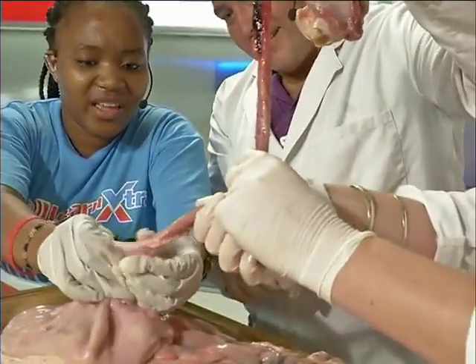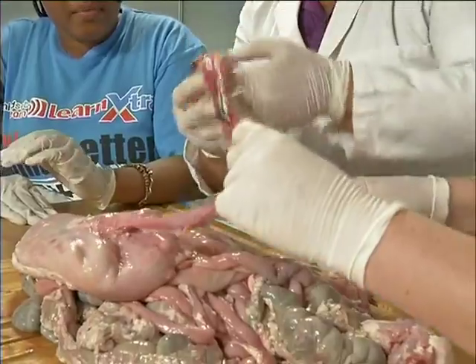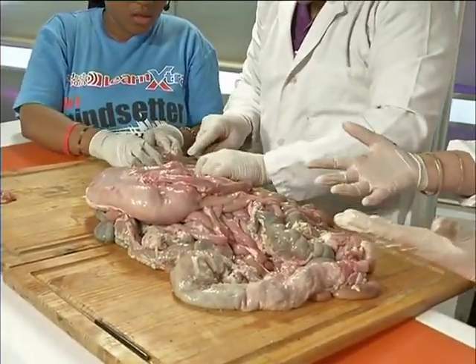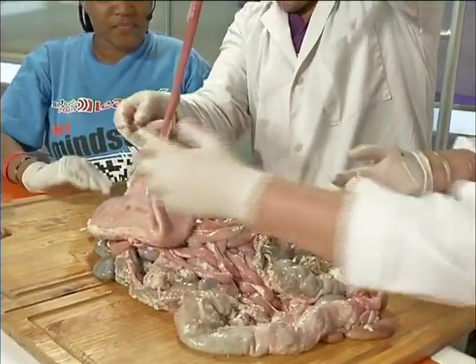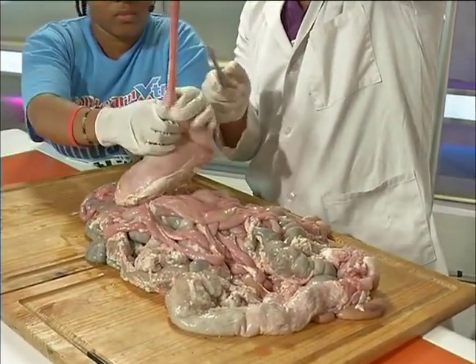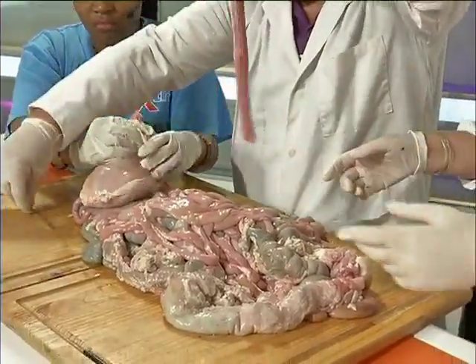Feels quite hard. Yeah, leathery, actually. Well, we're going to have a look inside. Remember how that feels. Because when we get onto these ones, you'll see if they feel the same or different. Well, what I'm going to do is cut this piece off just so that it's gone. And I'm going to cut piece by piece. So, Tara, if you can please, Luni, hold there for me. I'm just going to cut this away. You can put the stomach down for now.